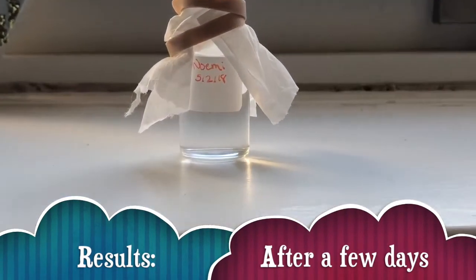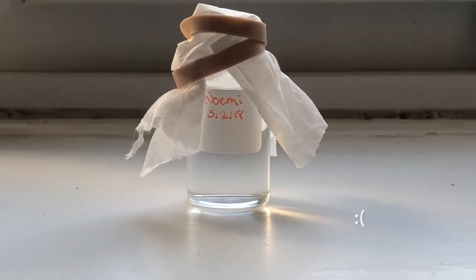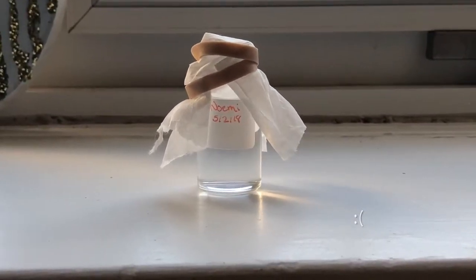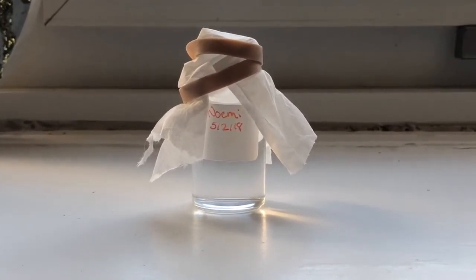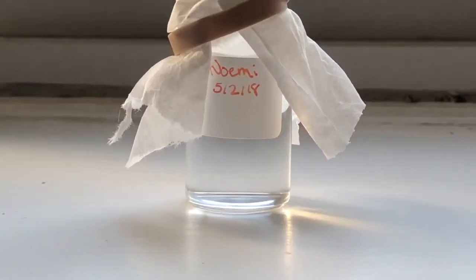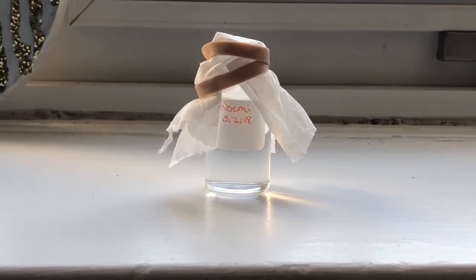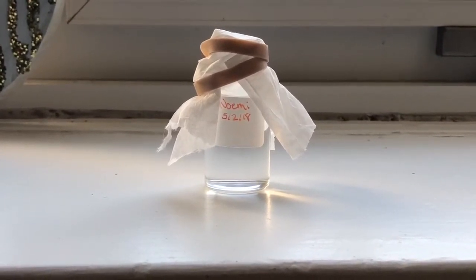So far it's been less than a week from the time the solution was prepared, and as you can see, there are no crystals yet. The solution looks just like it did when we prepared it in the lab. It is crystal clear, pun intended, but this goes along with the predictions I made in the pre-lab that it would take a couple of months for the crystals to grow.